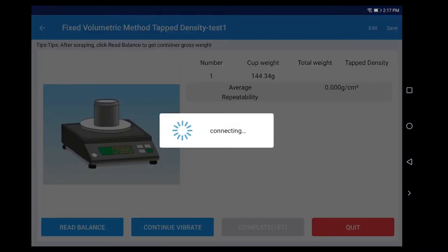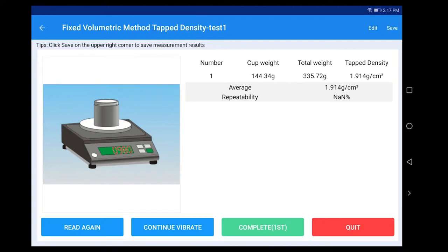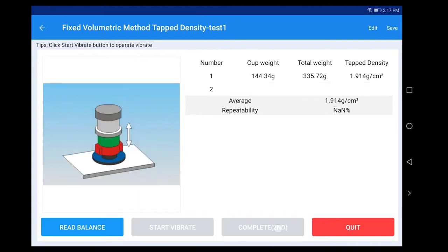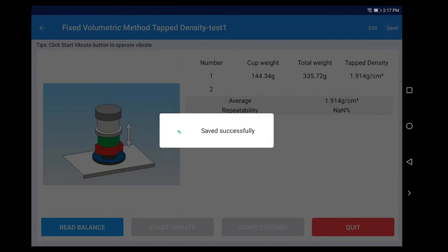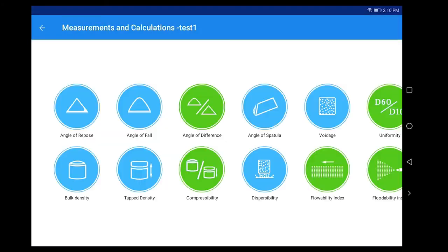After clicking the Read Balance, the tap density result will be displayed. Click Complete first, click Save, and click Quit to complete the tap density measurement fixed volumetric method. It is recommended to repeat the test for three times to calculate the average value.